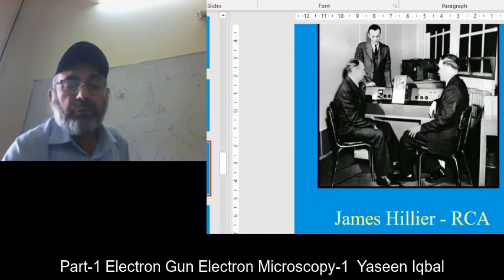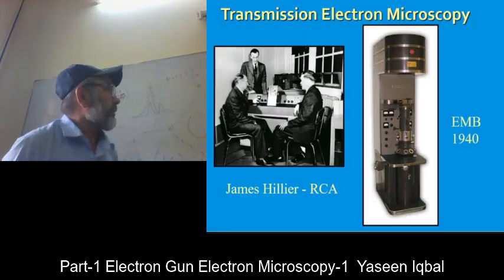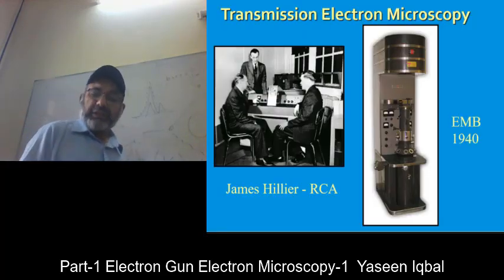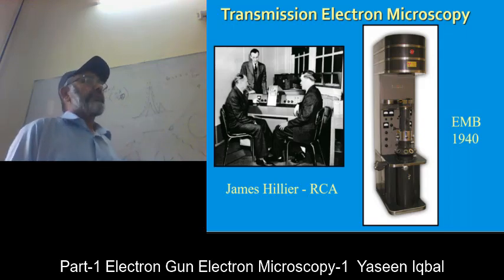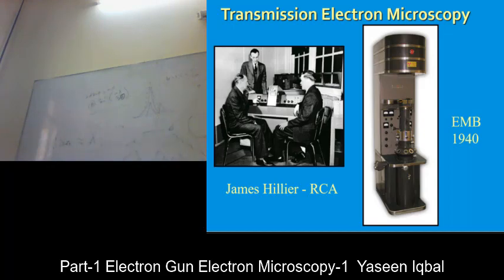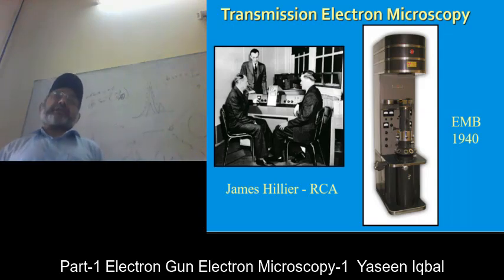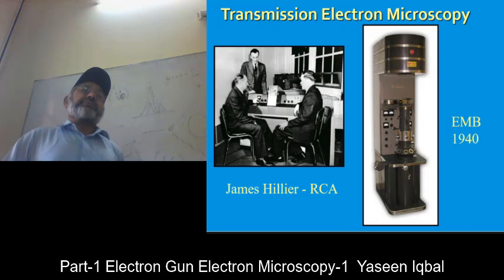Yesterday we reached up to here. So these were the initial days of the developments of the new transmission electron microscope. The scanning electron microscope is much simpler and easier, but the first development was that of the transmission electron microscope. So the scanning electron microscope came later.